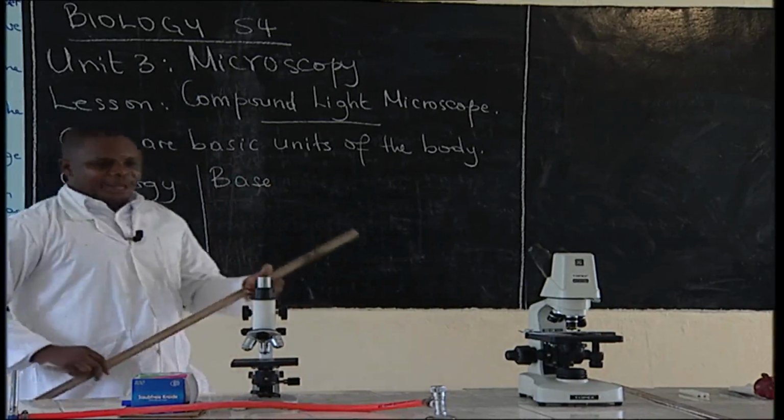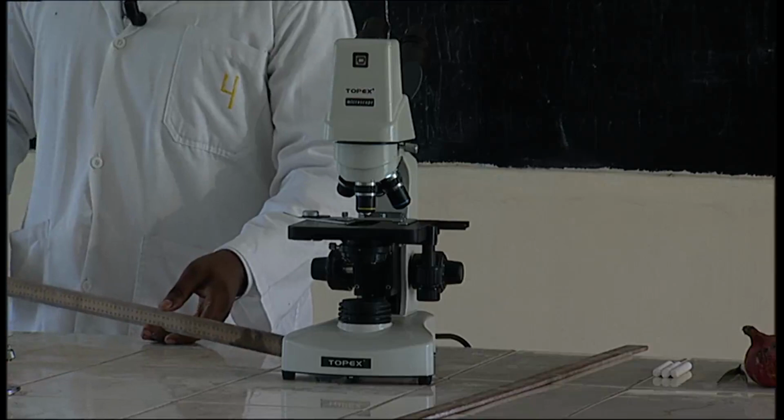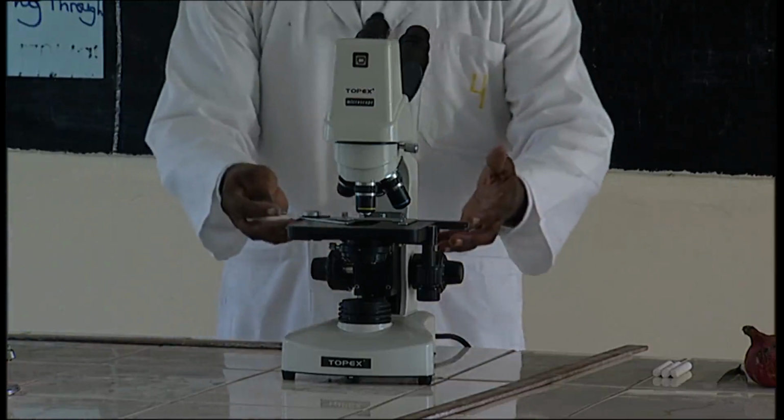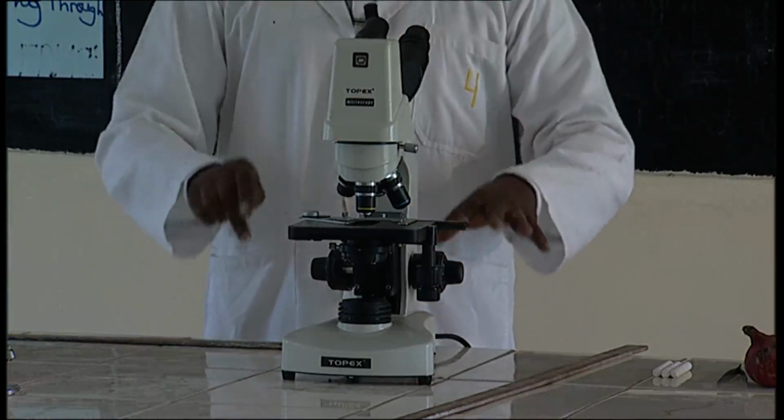And do you know the function of the base of a microscope? The base is used to support upper parts of the microscope and to make it stand stable.